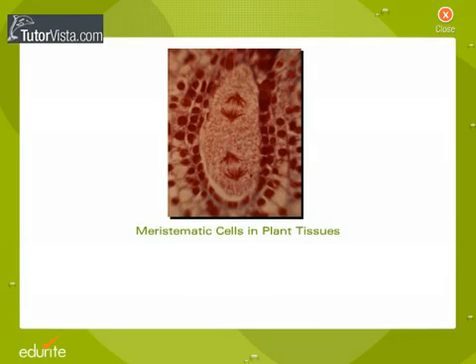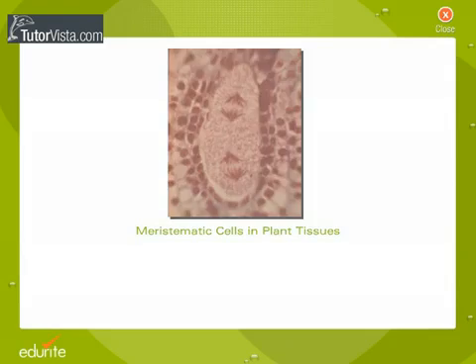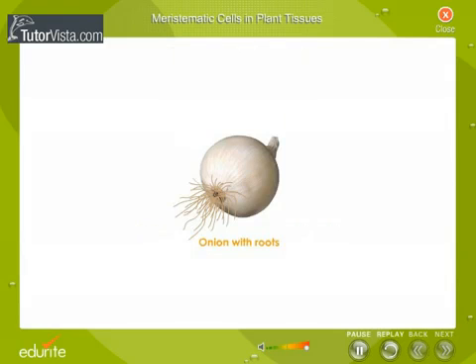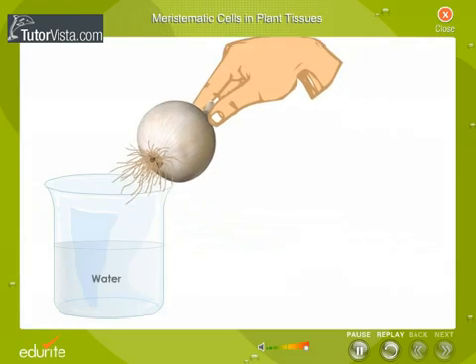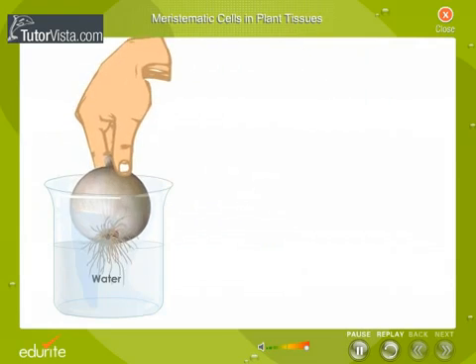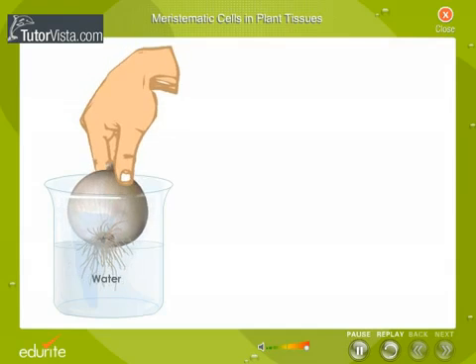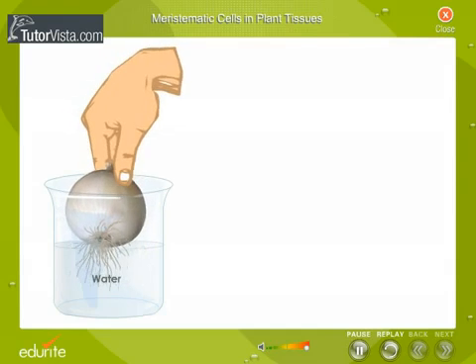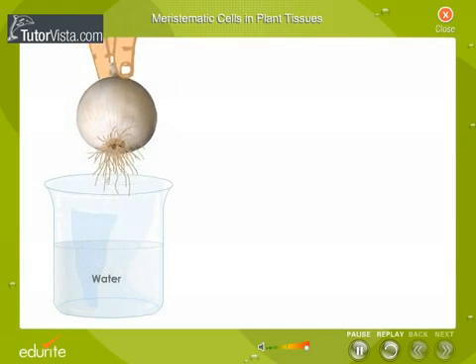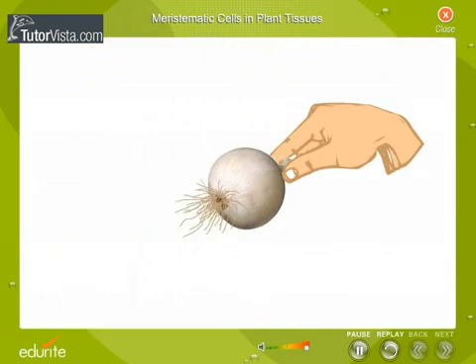Meristematic cells in plant tissues. Take a fresh onion along with its roots. Wash the roots with water and cut a longitudinal section of the root tip.